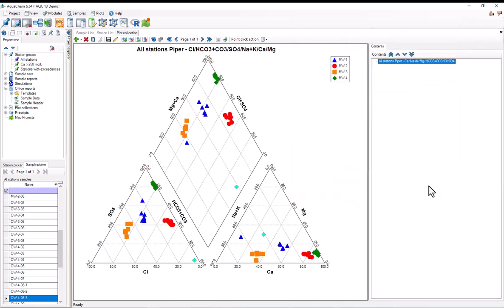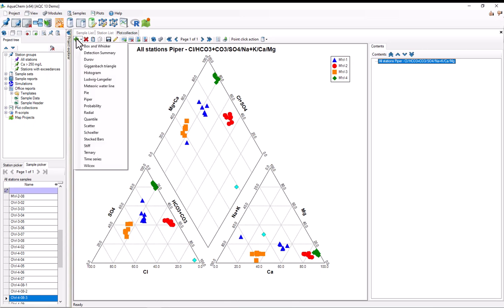Okay, so AquaChem also comes with some other commonly used geochemical plots, such as Durov diagrams. Creating a Durov diagram in AquaChem is also easy. To do this, I'd simply select the Create New Plot button, and I'd select Durov.